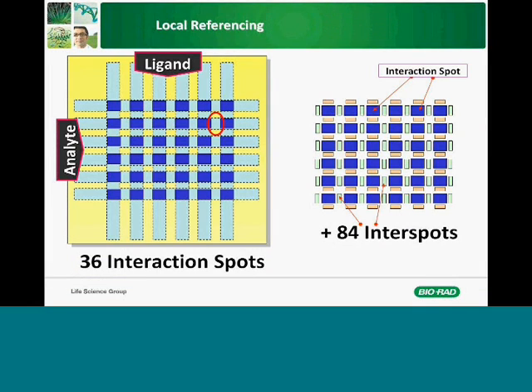In this slide, this is a top view of the chip, demonstrating the flow of samples. So in the first stage, we immobilize the ligand, and just in a schematic description from top to bottom, the 6 different ligands are printed on the chip. In the second step, the analyte is injected perpendicular to the ligand, and you have a matrix of 36 active spots that we image and measure in real time all the time, all of them.